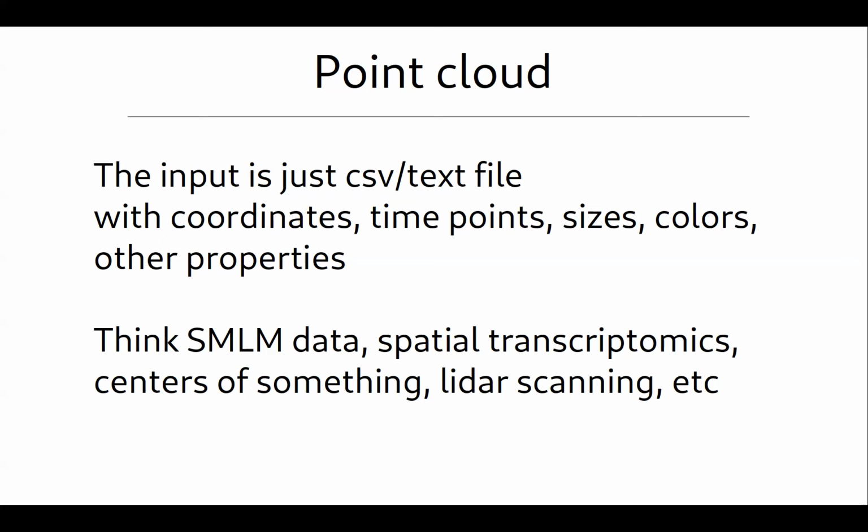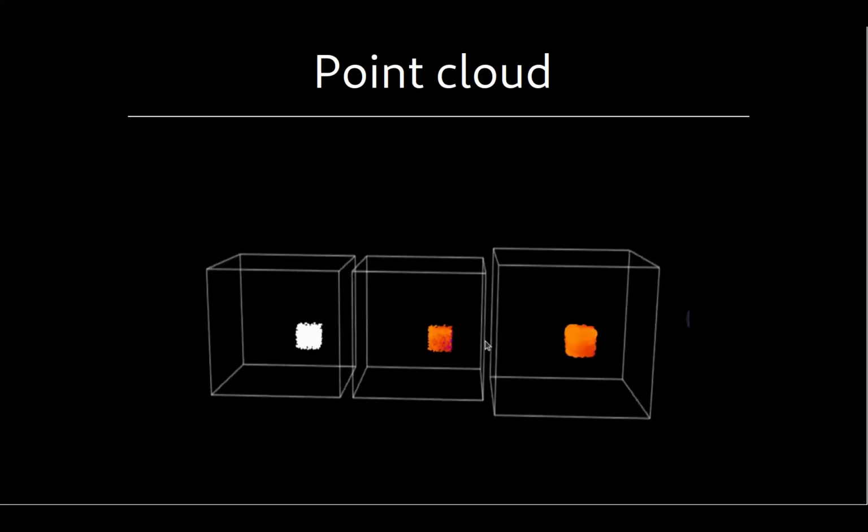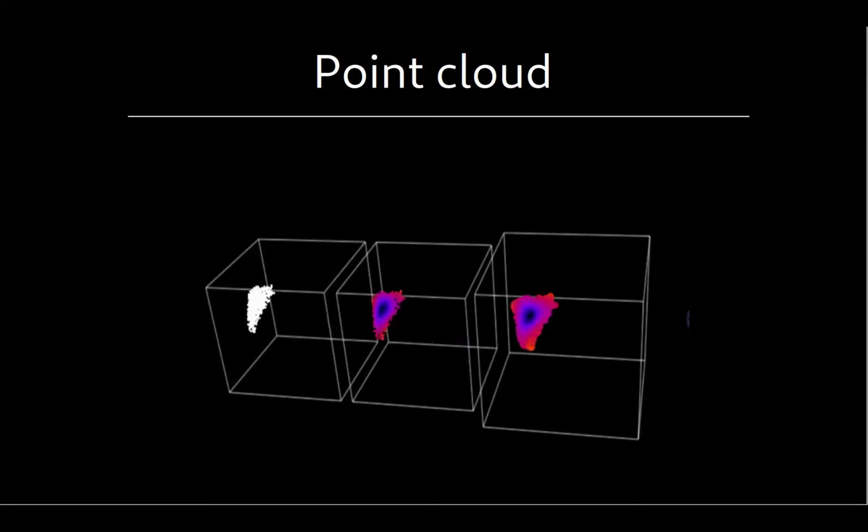So you have this laser scanning thing. Again, I'm not going to go into too much detail. Hopefully the things in the documentation are explanatory, but basically this is a little bit like an Excel wizard, you know, when you import things, it asks what is what. So this is basically the interface: you just map, you say, okay, this column is X, this column is Y, etc. And then you can look at the data.